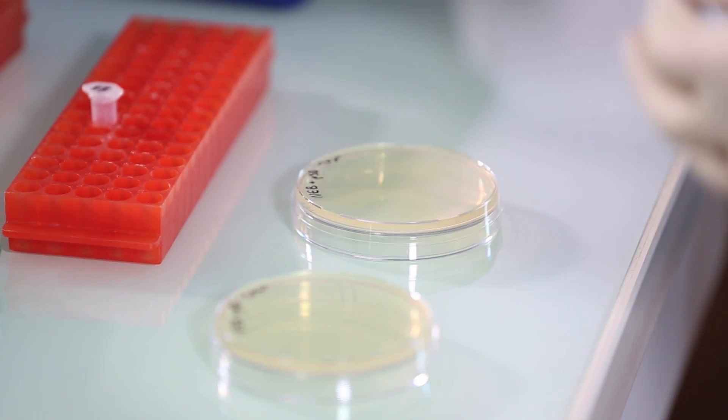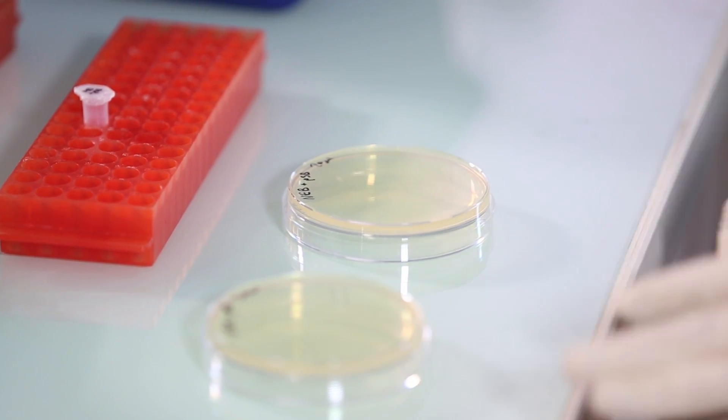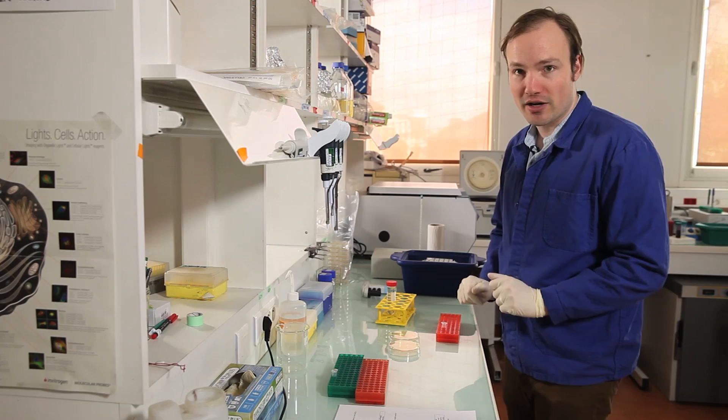So the reason that I like to prepare two plates is I don't know exactly what the transformation efficiency of this plasmid is going to be. And this improves the odds that I'm going to get exactly one plate with the right number of colonies.